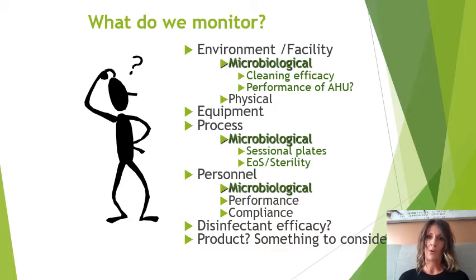So we have many ways of monitoring people in the clean room. We have their gowning technique, we have their aseptic technique, so how they make, their transfer technique, even down to the hand washing technique. We monitor all these things to give us an idea of our local microbial flora, and also it's a training aid. We help teach people how to behave in a clean room because aseptic technique and etiquette is really important to reduce the risk of microbial contamination, and also to give us assurance that they are able to perform these tasks adequately, lowering the risk.